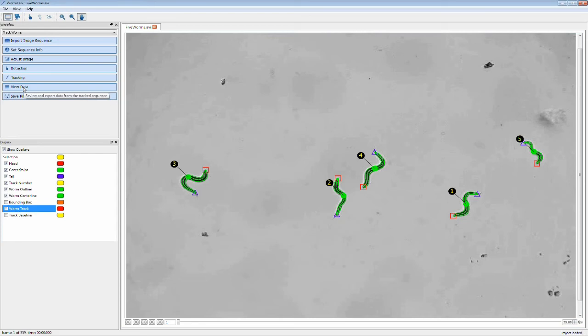Somebody asked a question. I'll just jump in right here. Said I didn't get the difference between the worm track and the worm baseline. So here's the worm track, right? You see that's the path of the center point. If we average that path, if we average out that sinusoidal track, we end up with the baseline, which runs through the middle of the sinusoid, if you like. So you get sort of a more direct distance traveled along the baseline.